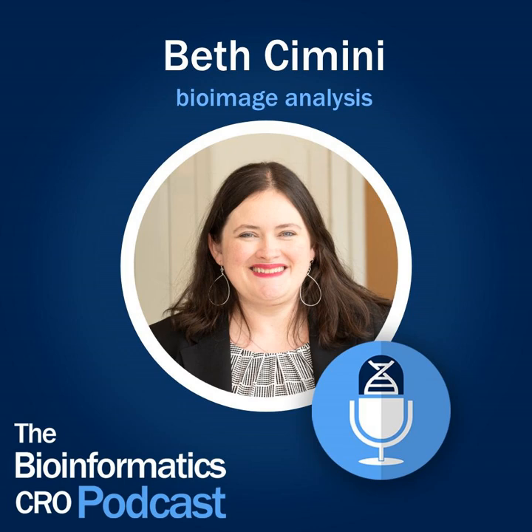But of course, we don't want to artificially inflate the differences between two parts of our image when we're trying to make detailed quantitative measurements. And so the things that will help you make quantitative measurements will also help make your images prettier, in that they're in focus, they're clean of debris. But there's a lot more we're allowed to do when we're just going for a pretty picture.